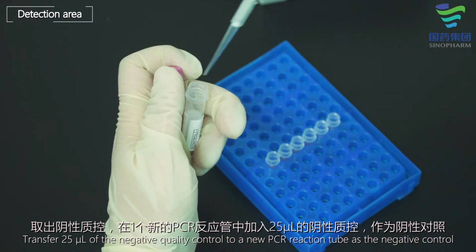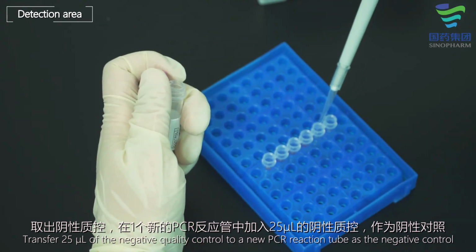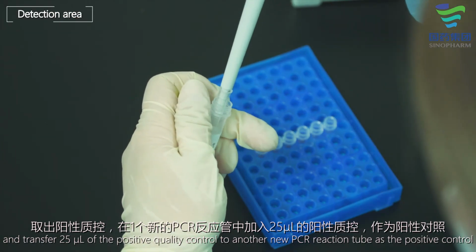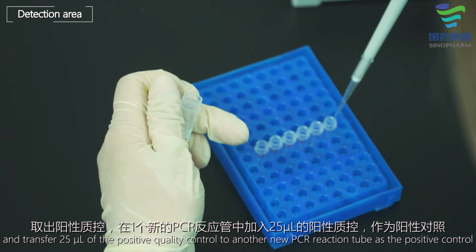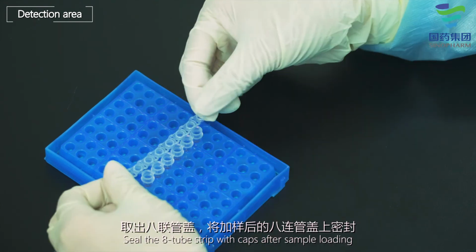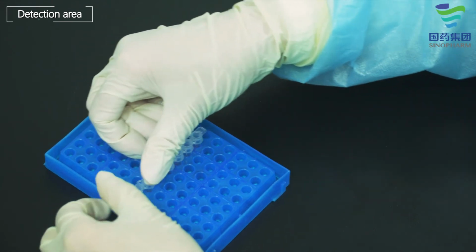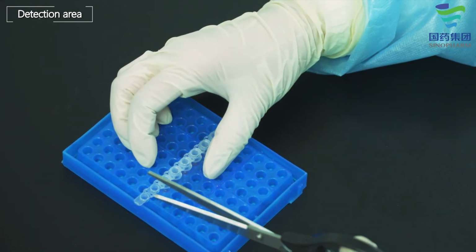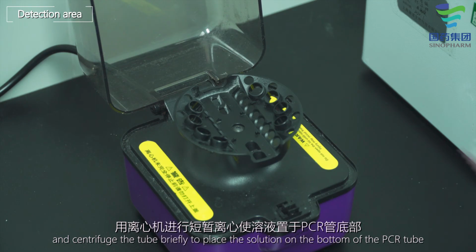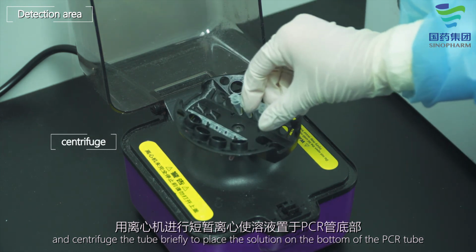Transfer 25 microliters of the negative quality control to a new PCR reaction tube as the negative control, and transfer 25 microliters of the positive quality control to another new PCR reaction tube as the positive control. Seal the 8-tube strip with caps after sample loading. Shake or flick the 8-tube strip with fingers, and centrifuge the tube briefly to place the solution on the bottom of the PCR tube.